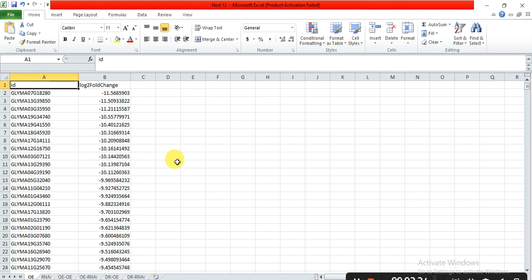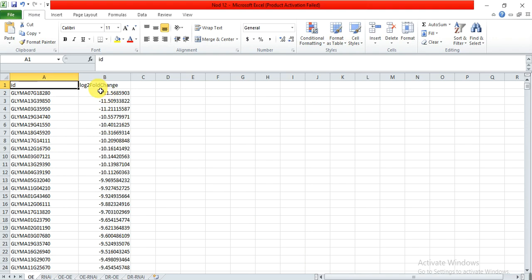This is my RNA-seq data — the list of all genes and their log2 fold change values compared with the control for the overexpressed line. First, I want to know which genes were upregulated. Positive log2 fold change values indicate upregulated genes, while negative values indicate downregulated genes.